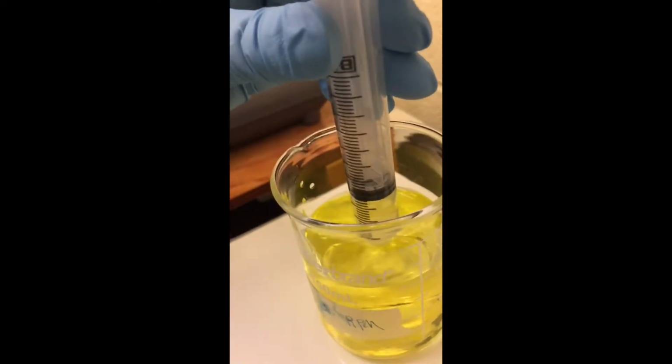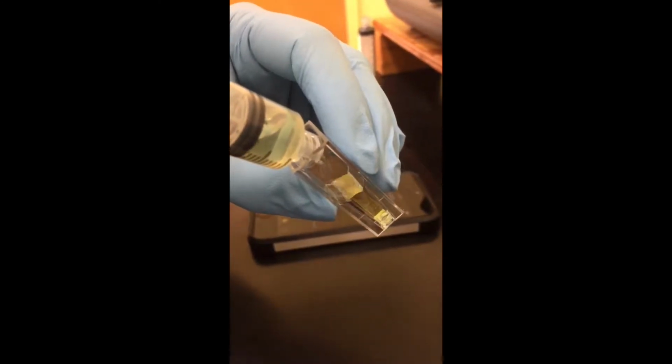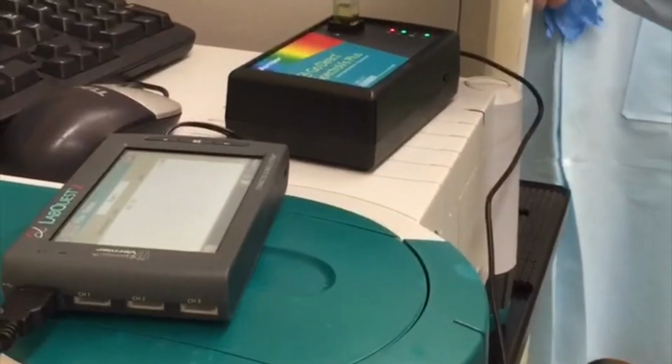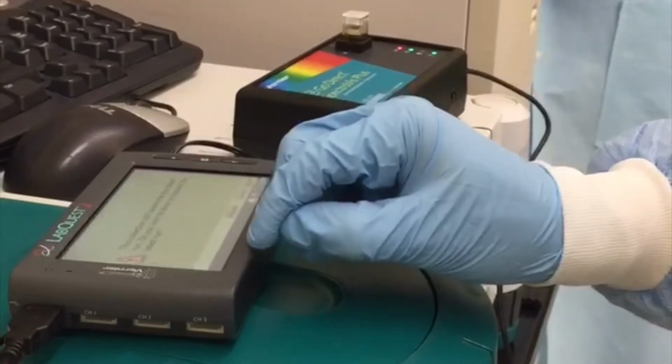Once the sample was taken, its absorbance was measured using the spectrophotometer. To do this, the sample was placed in a cuvette and a cap was placed on the cuvette. The sides of the cuvette were then cleaned using a Kim wipe. The cuvette was then placed into the spectrophotometer and a group member pressed run.